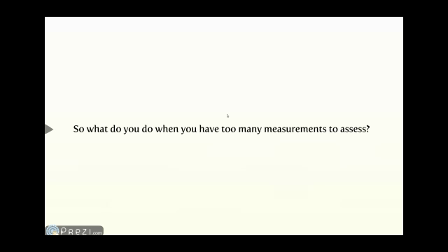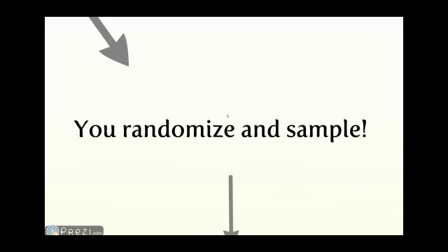And you make that subset big enough so you can draw statistical conclusions from it, and you make it representative enough so you can scale it to the entire population. So you randomize and sample among the population to take a subset, and you test the subset, and you let that test tell you, draw conclusions on, how many Swedes would have swine flu. And it's the same thing for the 2D gel data quality control.